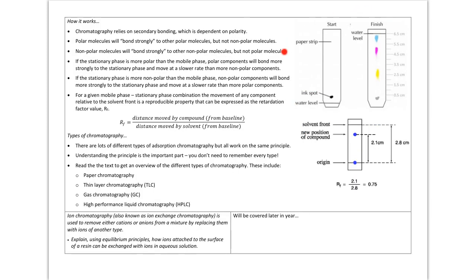As we go through this, I really do want you to keep this picture in mind of what we did in the lab. And I know at the start it talked about a whole lot of different types of chromatography, and I'll come back to those, but the principles by which they all work are the same. So if you understand this, you can apply it to a whole different range of types of chromatography.